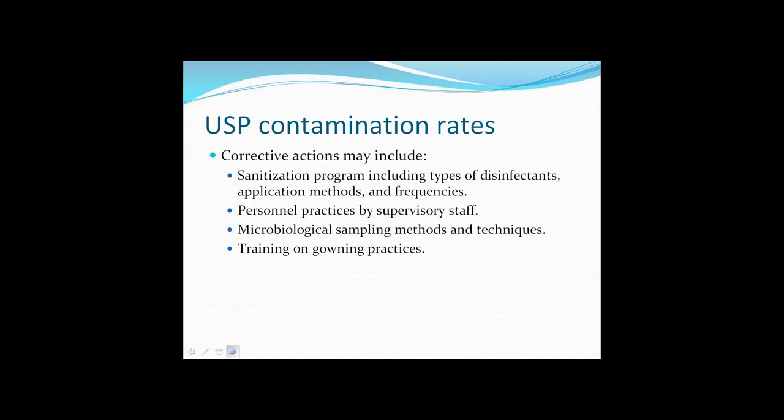It considers increased surveillance of personnel by supervisory staff, consideration of the microbiological sampling methods and techniques, and also touches again on the issue of training, which is always the recurrent one in most discussions of CAPA.